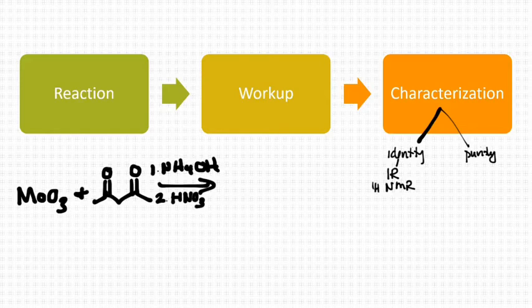To establish purity, how would you tell whether it was pure? I'm going to leave that one for you to think about. And you can design a very easy experiment, something you already know how to do. Hint, hint, for how you can establish the purity of your compound.